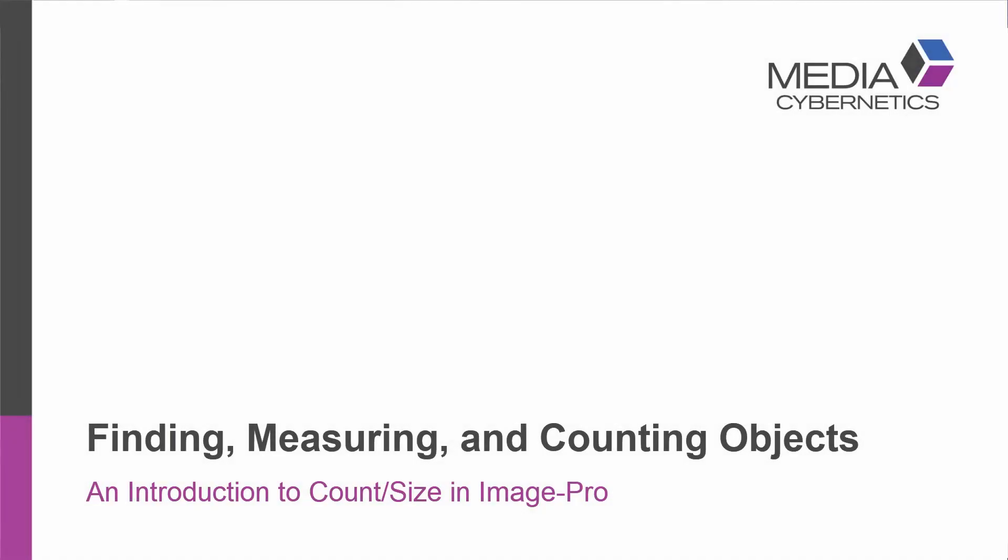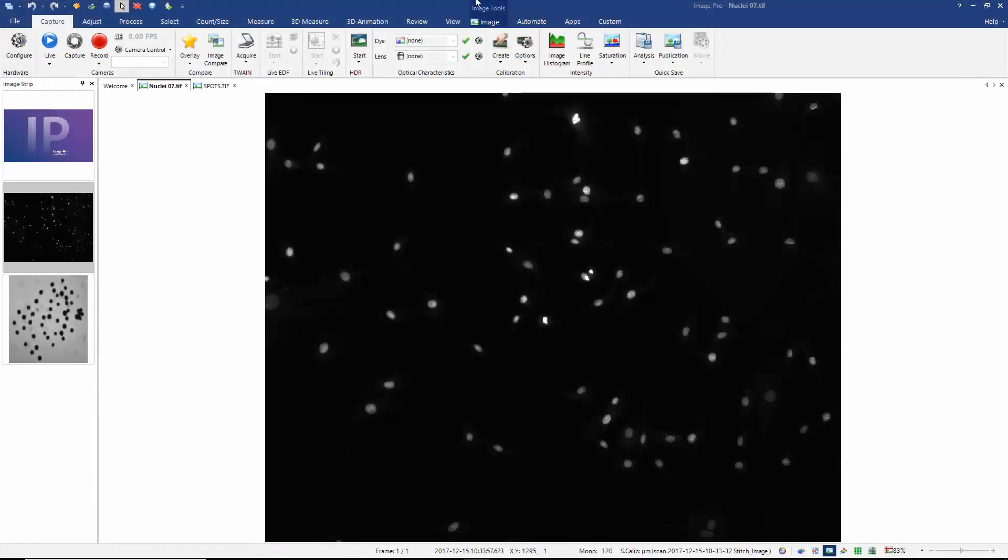Hello, thank you for joining me. This is a tutorial on one of our most useful and frequently used functions in ImagePro: finding, measuring and counting objects of interest. This is commonly known as segmentation and this is done in the count size tab. So let's select that.